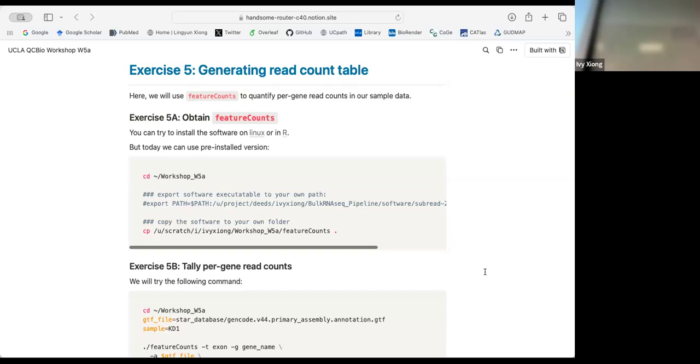I didn't know about what you shared. Yeah, so that's actually separate. Oh, separate. Okay. For alignment, we're using the KD1 S1 sample data.